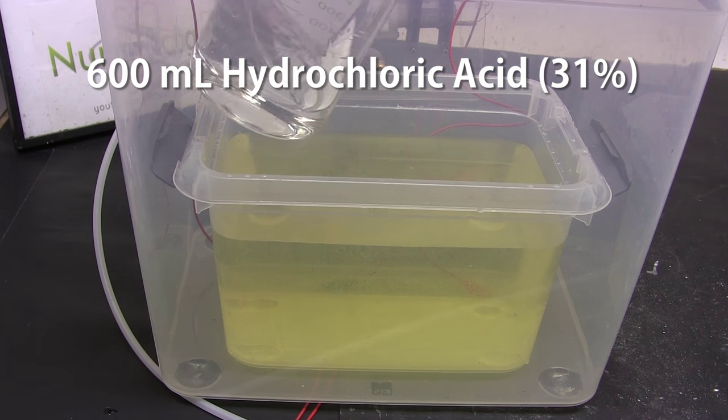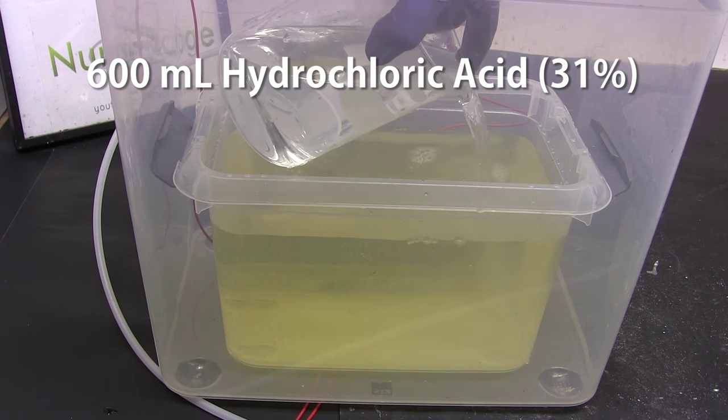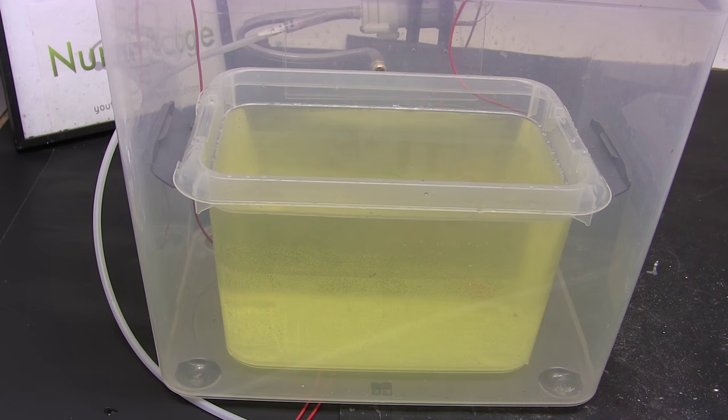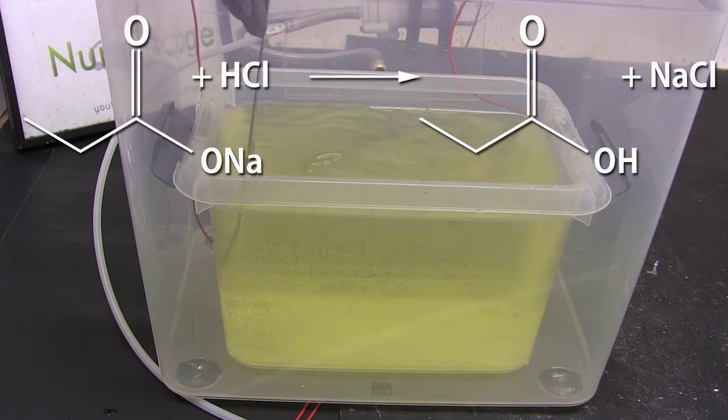Now to convert the sodium propionate into propionic acid we add 600 milliliters of 31% hydrochloric acid. This is a huge excess of hydrochloric acid and will ensure the reactions proceed forward.